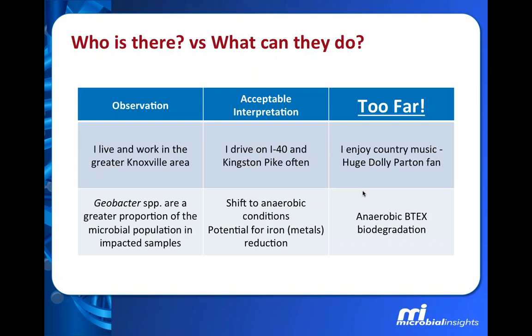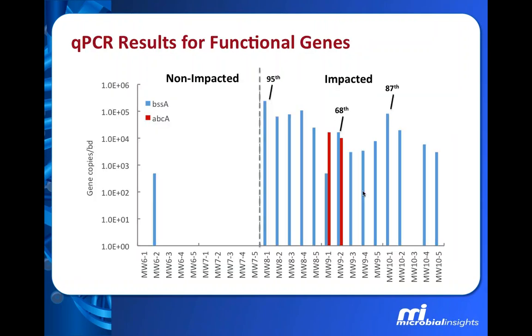Some can do it and some can't. So what we need to do then is use these complementary tools like our quantitative PCR so we can start to draw more definitive conclusions regarding BTEX biodegradation.